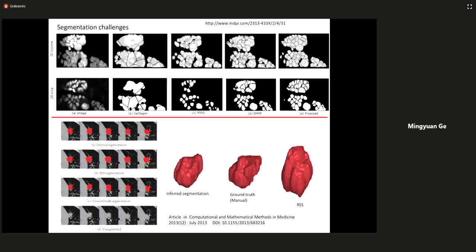And also for data analysis, we also have challenges in image segmentation. Like if we have an image like this one, for human eyes, we can easily think, okay, this is a big green, this is a small green attached to it. But how to make the algorithm work reliably is kind of difficult. There's a traditional algorithm called watershed segmentation, but people have also identified new machine learning based algorithms, which are still ongoing.